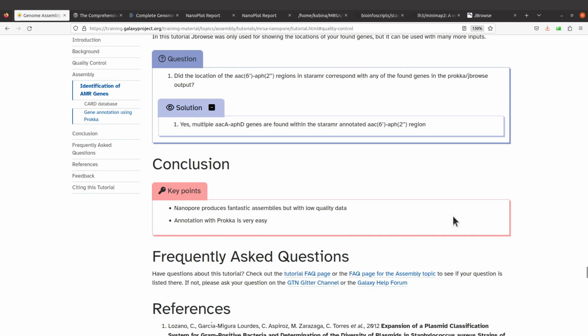So in this tutorial, we have been able to perform a number of activities to understand the organism better with respect to antimicrobial resistant genes. And so it becomes very easy now to tell your story or write your report based on whatever you have seen here. Of course, this is where the visualizations will come. So doing the visualizations allows you to understand the data better, and then you can proceed with the other analysis. And if you're interested in more bacterial genomics tutorials, then you can check this playlist that's being shown right now.